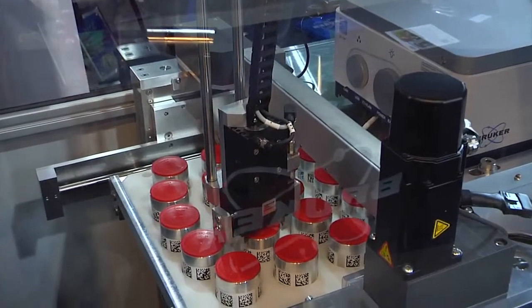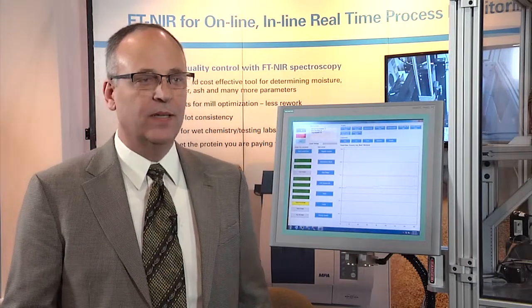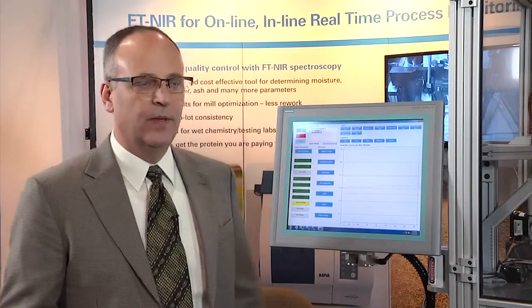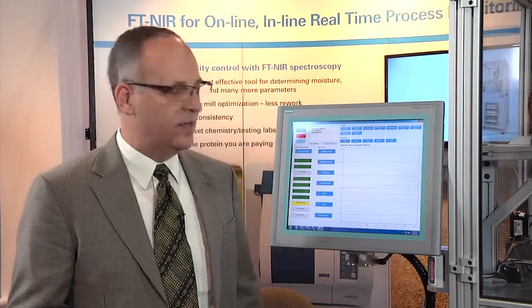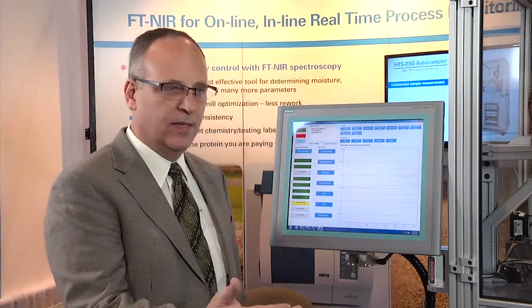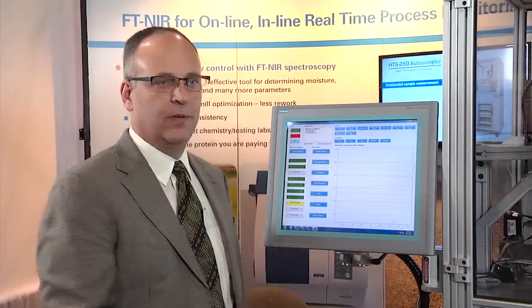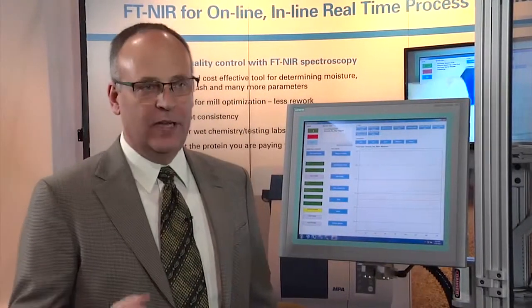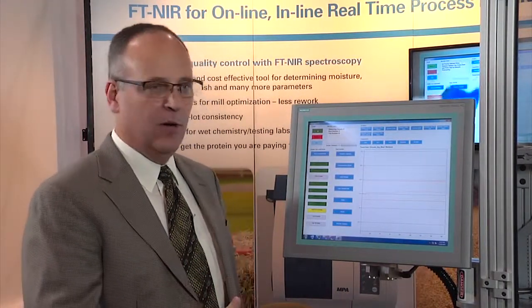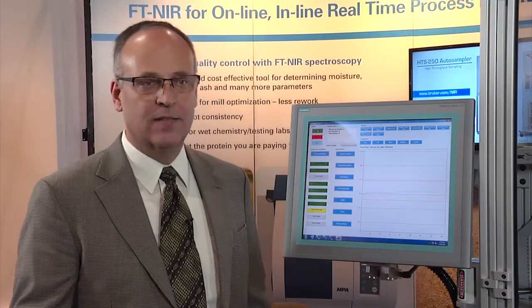The chief benefit of the HTS 250 auto sampler is that it frees the lab person up to do other things while it's working. The total elapsed time for analysis is the same either in manual mode, if this were a benchtop instrument standing separately, or in automated mode in the HTS auto sampler. The time required to enter the information for each sample, whether it's in manual mode or in automated mode, is essentially the same. It makes no difference in total elapsed time of analysis.